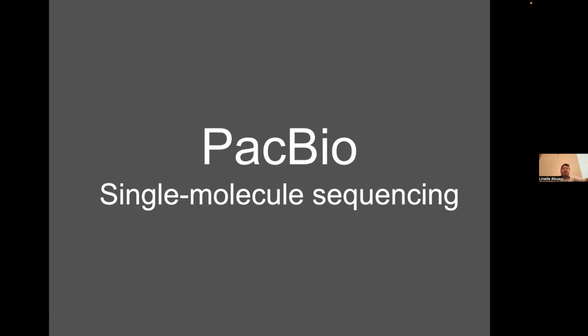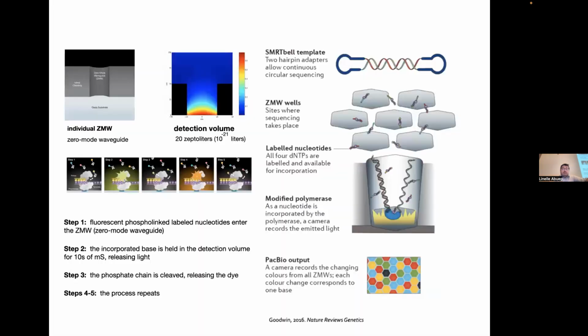PacBio. So now we go into third generation sequencing. As you can recall, no amplification of the library and no amplification of the template. So this is a very busy slide, but essentially the PacBio invention is not the sequencing part. It's this piece of material, this zero-mode waveguide. Essentially, in these wells, when light refracts, it is very localized inside the well and very intense. So you can detect single molecule level incorporation. So this time is different.